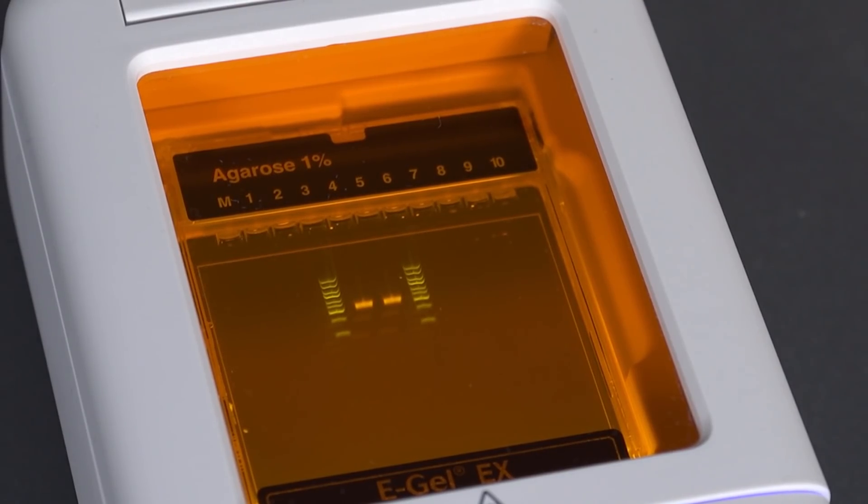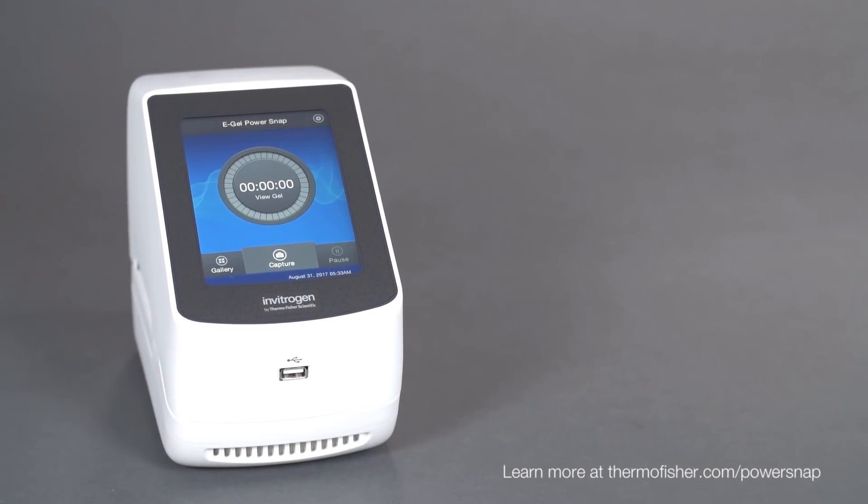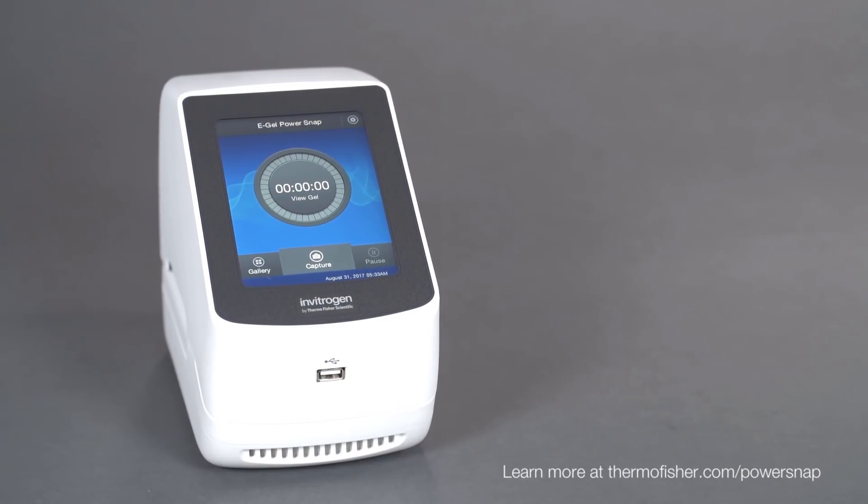Simple setup, fast analysis. Invitrogen eGel PowerSnap electrophoresis system — simplify analysis, expand possibilities.